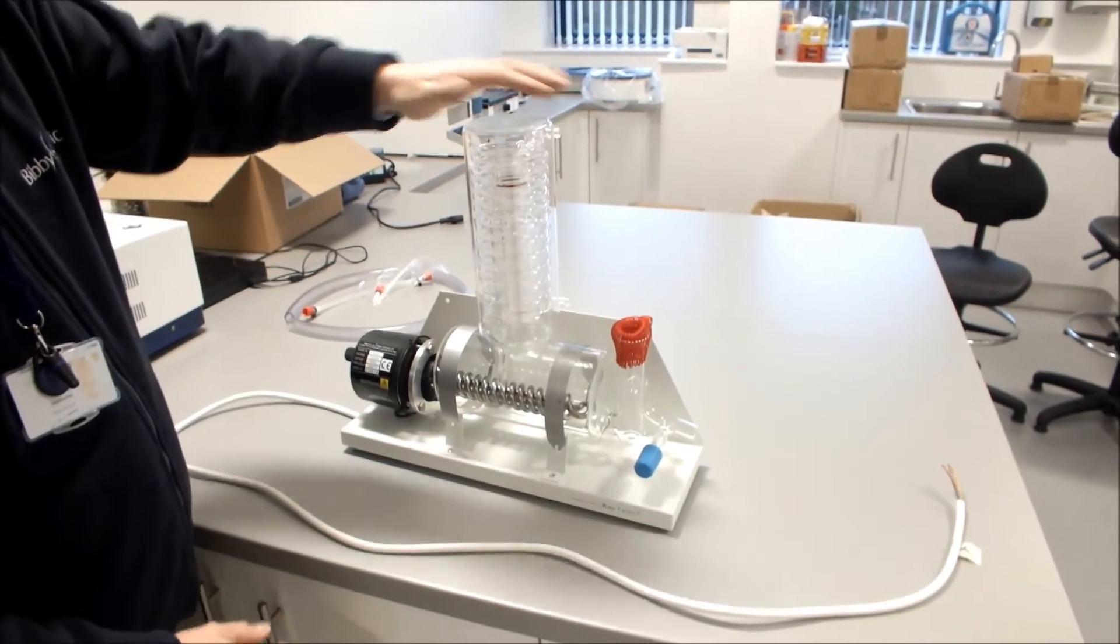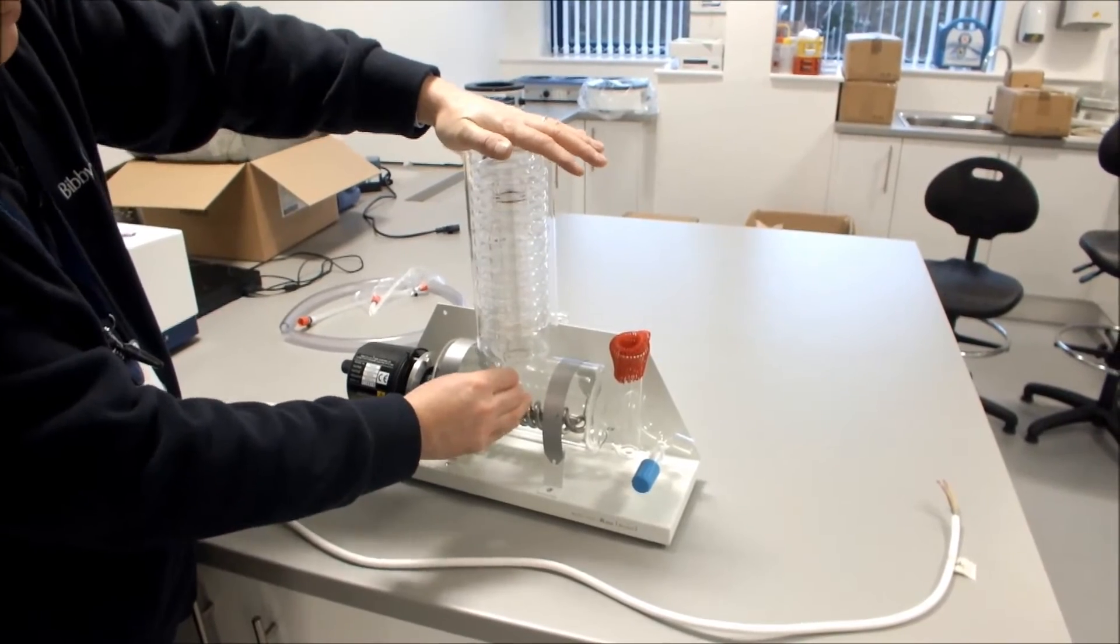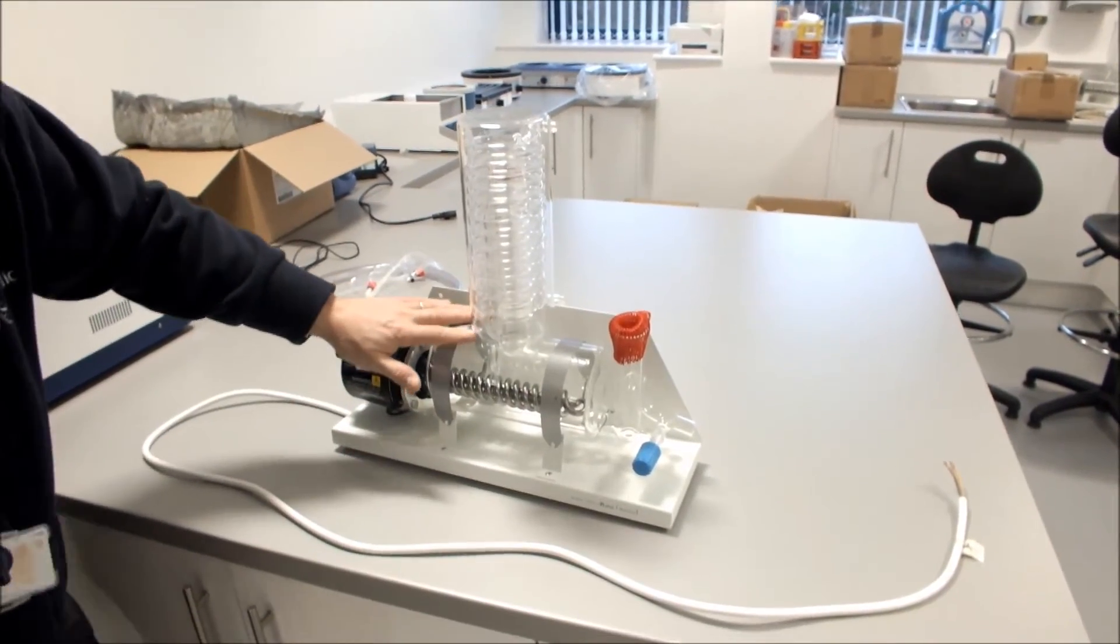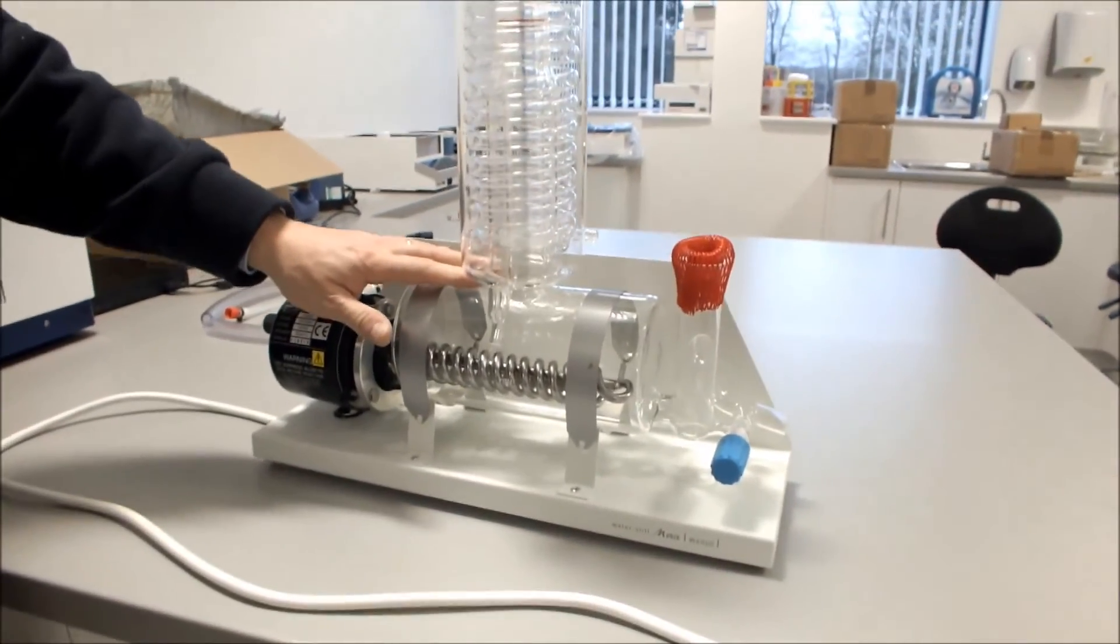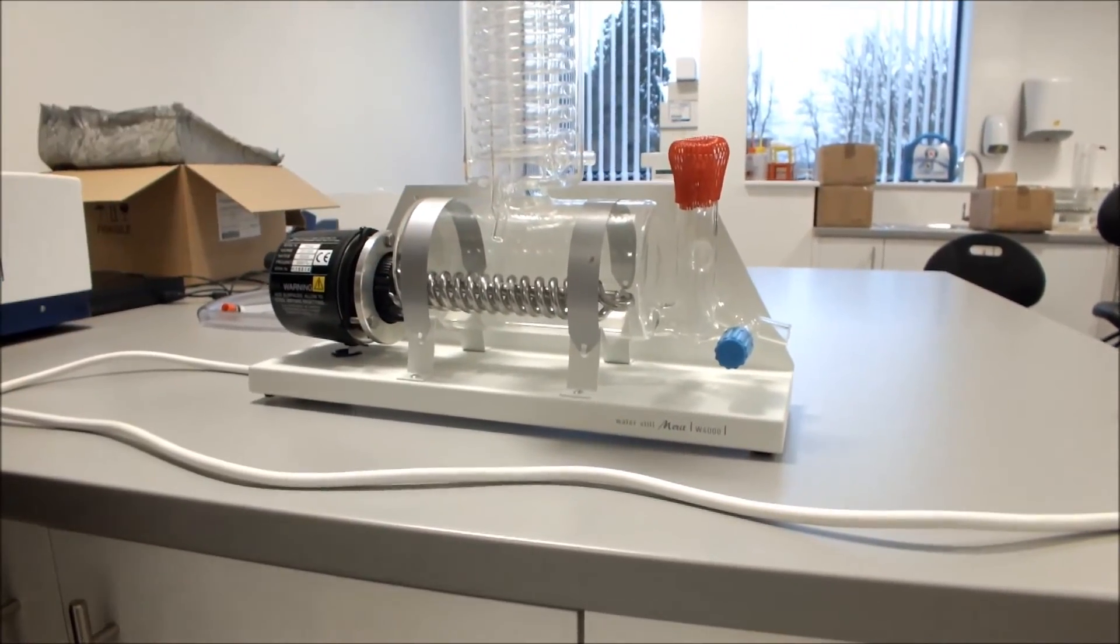Place your condenser on the vapor tube like so. When you feel some resistance, press down slightly, just to create a seal. And you should have a 5 to 10mm gap between the bottom of the condenser and the top of the boiler.